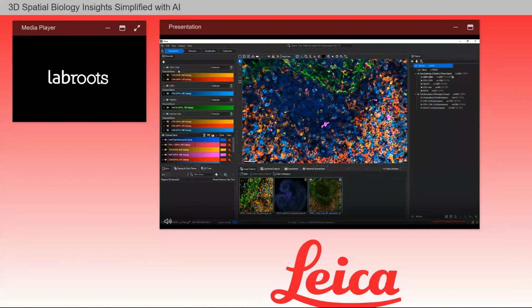In the channel display settings, there is a new button that allows you to expand all of the advanced channel LUT settings. This allows you easier access to the LUT and makes adjusting the dynamic range much easier. You can click on the same button again to collapse all of the advanced channel LUT settings.